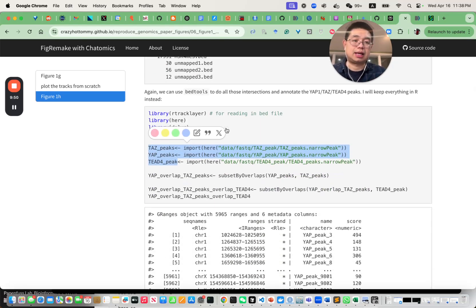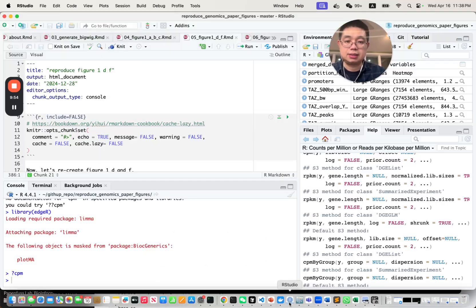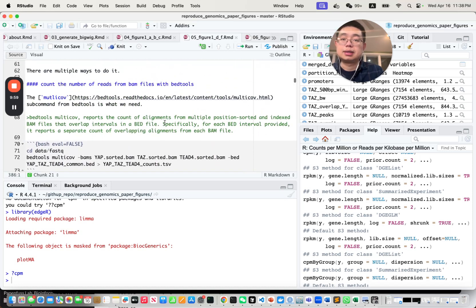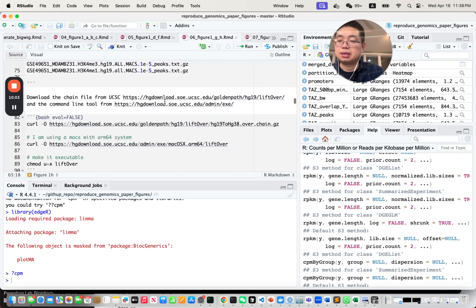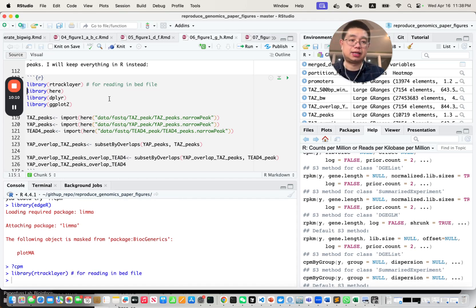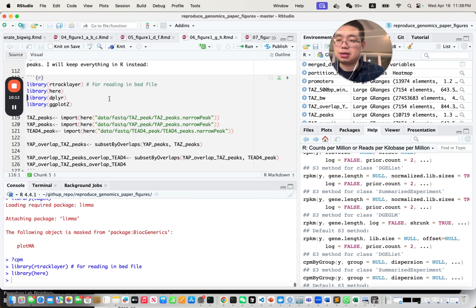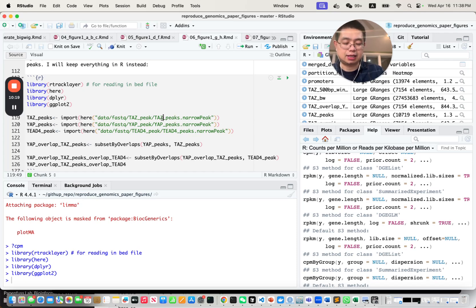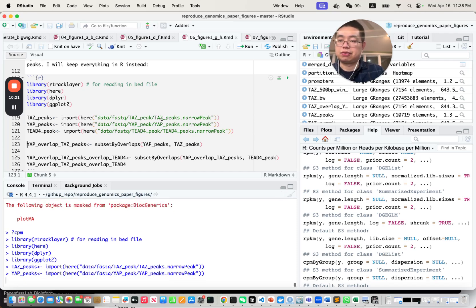To keep everything consistent, I'll do everything within R. Loading the necessary libraries: rtracklayer to read in the BED files, dplyr, and ggplot2. Now we can read in the BED files — the peak file for TAZ, for YAP, and for TEAD4.